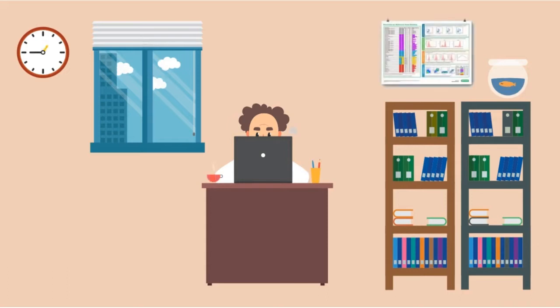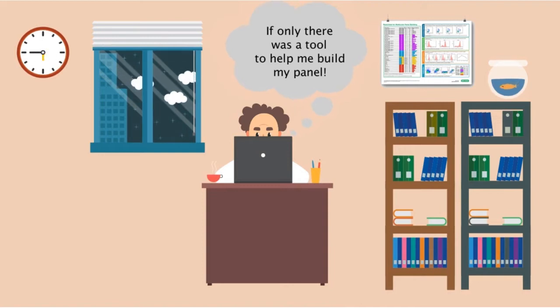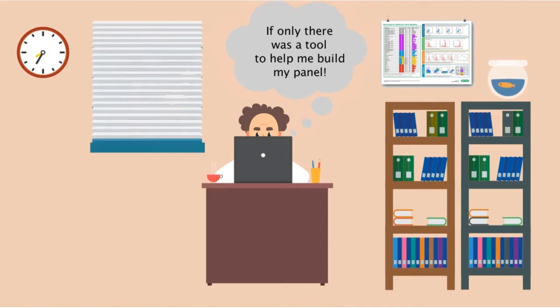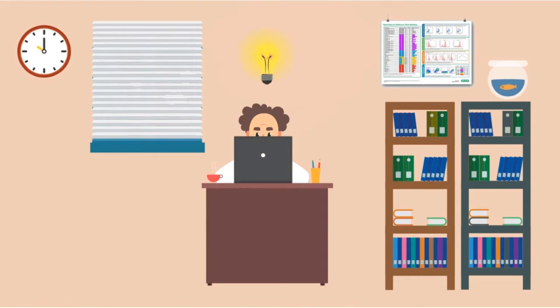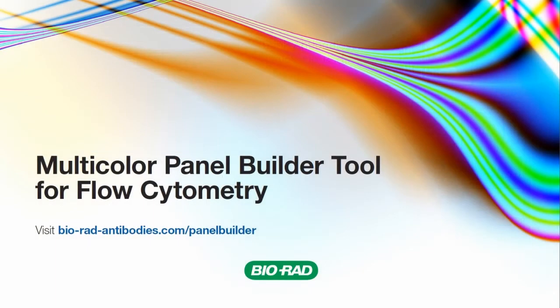Knowing which combination of fluorophores to use when building a multi-colour panel for flow cytometry can be a time-consuming process. To help you design your experiments, BioRAD has developed a new interactive multi-colour panel builder tool, which we are about to demonstrate.